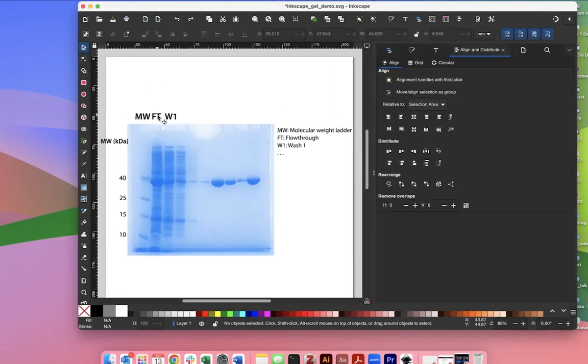So what I'm going to do is I'm going to come over here. I'm just going to click the ones that I want to move these over. I'll make a copy of this. And I'm going to click T. It's going to let me easily edit it. I'll Command A to select it. And maybe I just want to name it LY for my lysate. Now what I want to do is I'm just going to click them all again, just make sure that I align them.